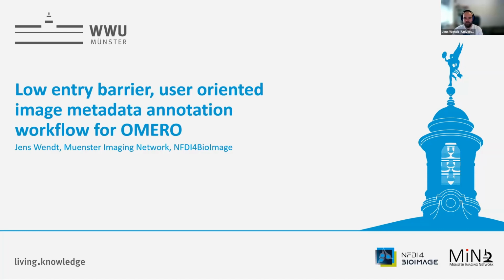The workflow I'm going to present today is actually already a bit older. I've done this last year already. Just as an FYI, the uptake is starting slowly in our own university, so I hope to get the word out and maybe more people will be interested and provide me feedback on how I can improve this. Let's get started. I'm going to present a lower entry barrier, user-oriented image metadata annotation workflow for Omero with a lot of buzzwords. So let's get into it and look at what it's all about.